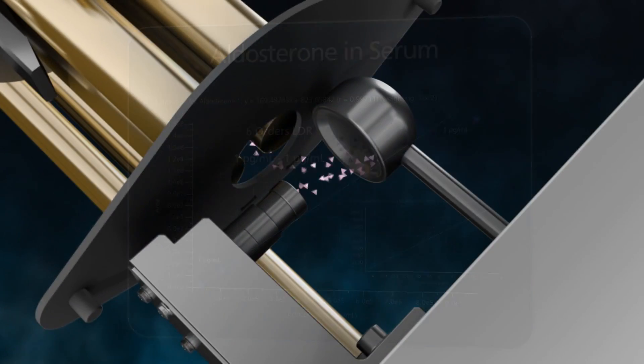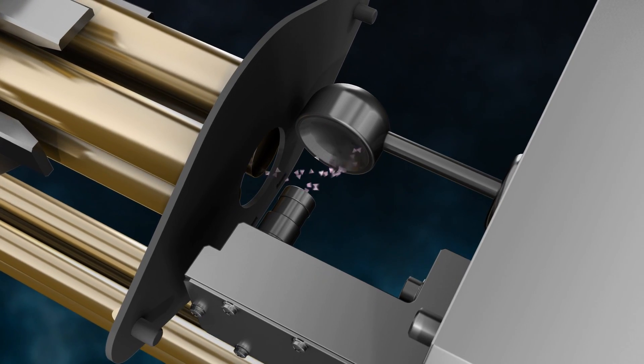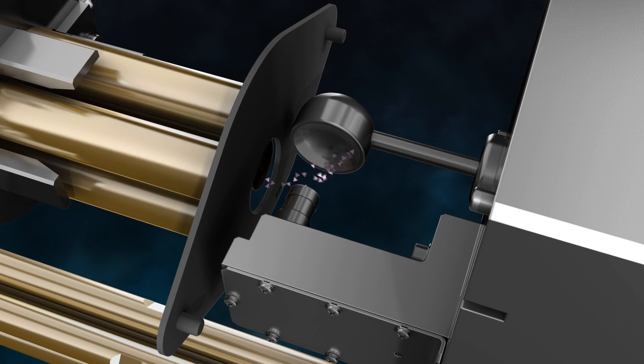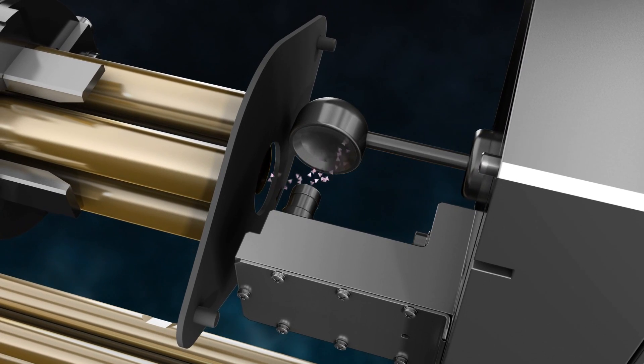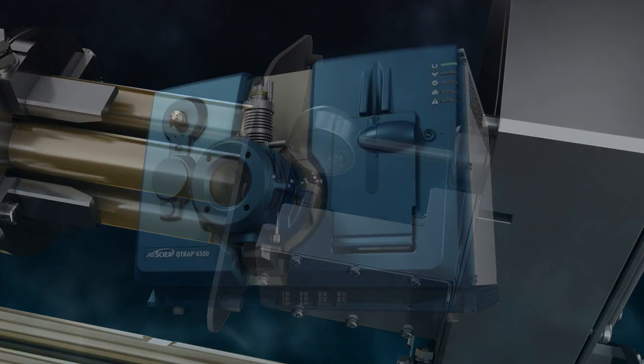The dual RF ion drive technology expands performance levels further through its ability to switch between high-mass and low-mass optimized ion transmission settings, delivering a no-compromises solution between mass range and sensitivity.